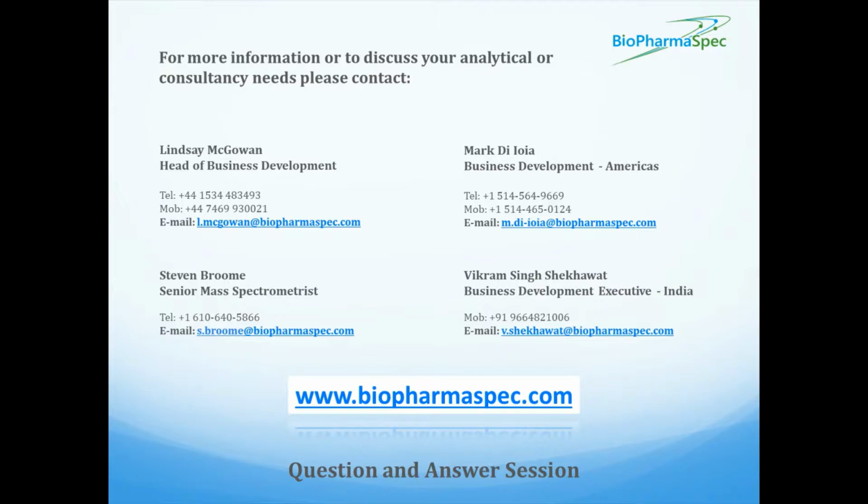Great. Thanks, Stephen. So we do have some questions, and I will get into reading those now. So the first question is, you mentioned that some process chemicals can have an effect on the structure of the product. Can you provide any examples of such structural modifications and how I could see if they exist on my product? For example, I'm seeing aggregation issues and now wondering if this could be due to an impurity.